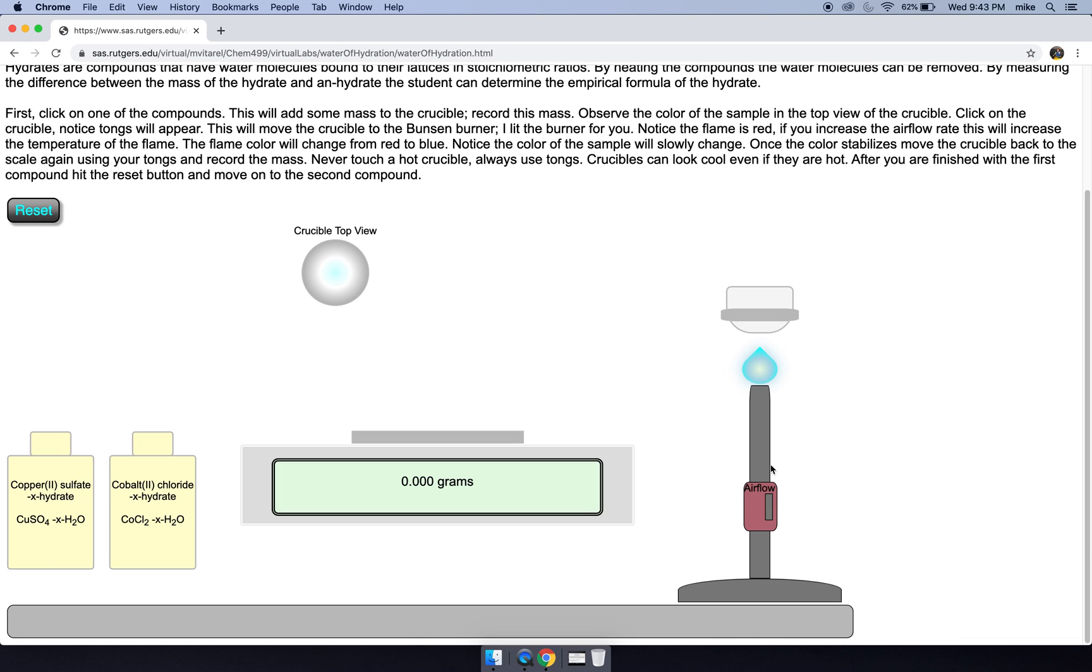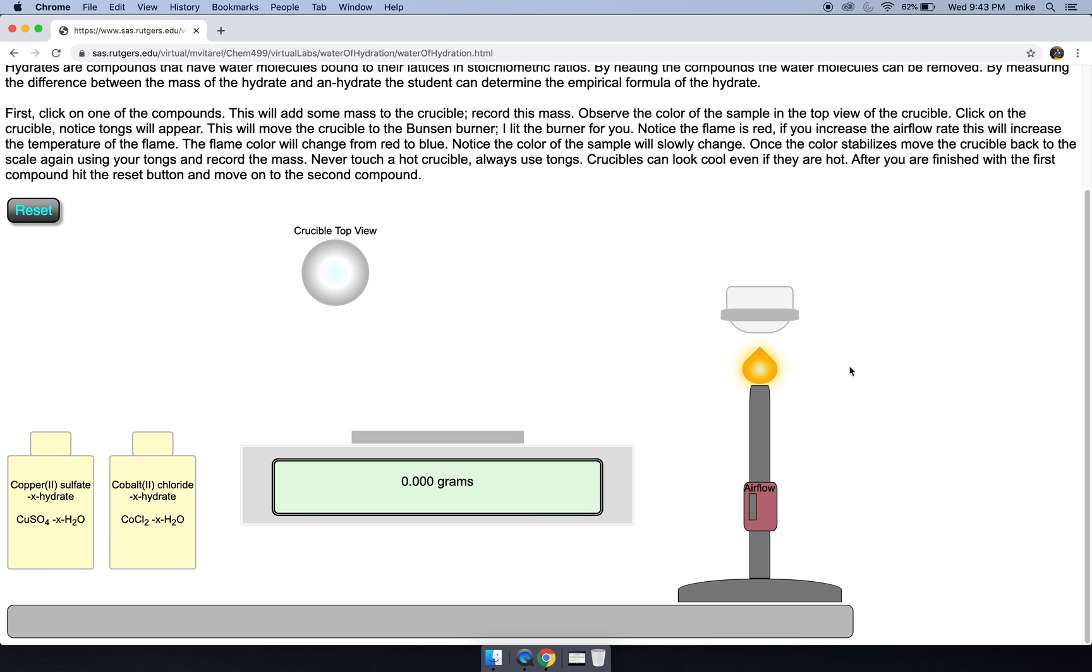Now I'm gonna put it back to this red flame. There's another negative of this red flame in the lab. So this red flame is indicative of incomplete combustion. Another negative is you'll get some soot, some carbon soot on your crucible, and that'll impact your mass and you'll get an improper value.